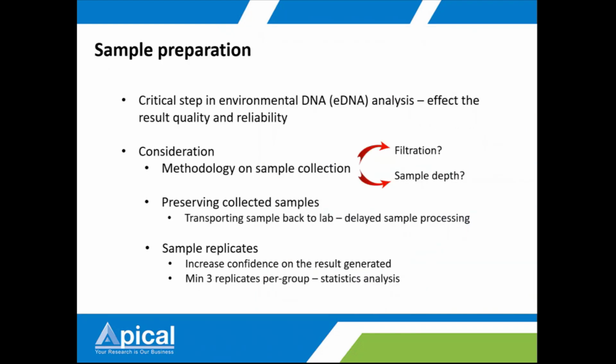Right, so let's start with the first step, which is sample preparation. This is a very critical, crucial step when running environmental DNA. If you are unprepared or if you did not capture correctly, it will affect the result quality and reliability.